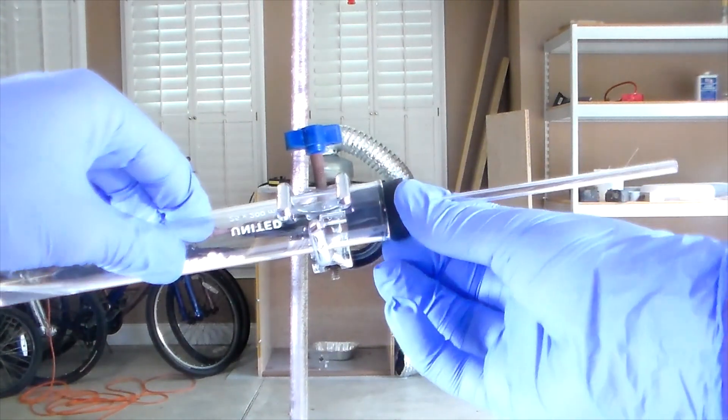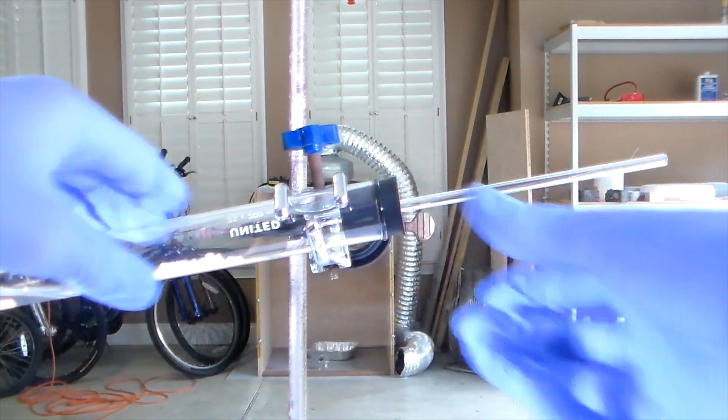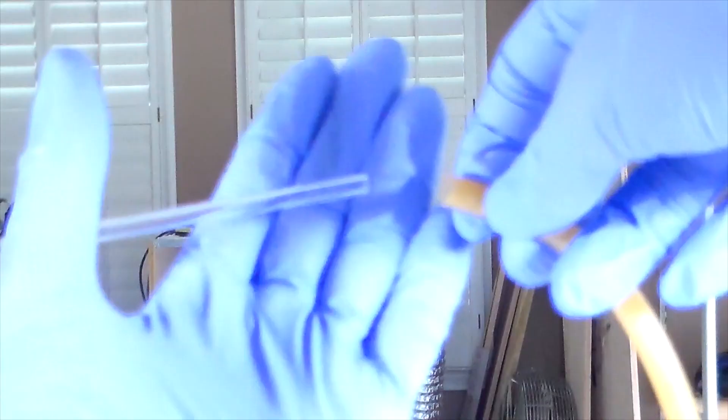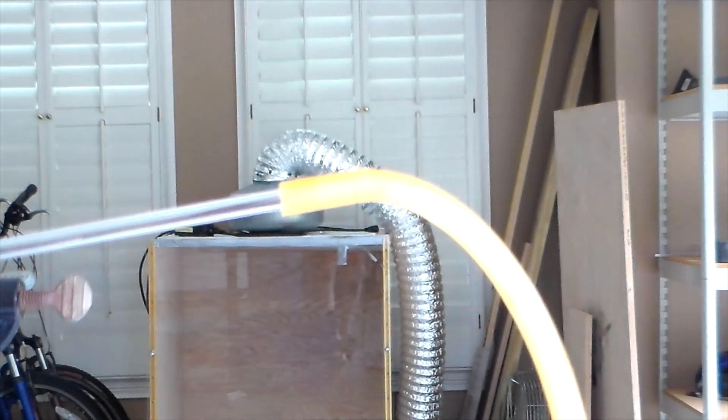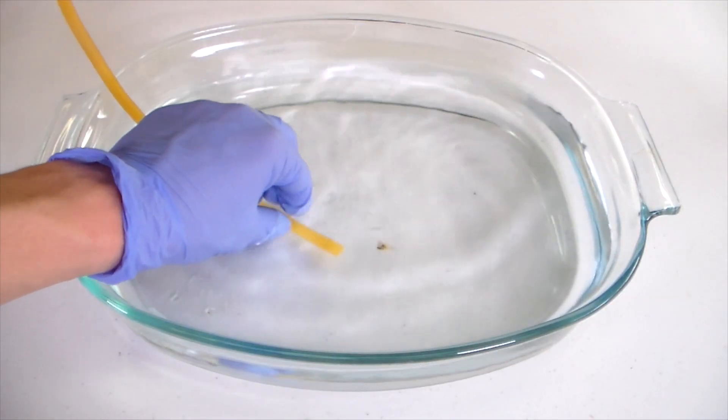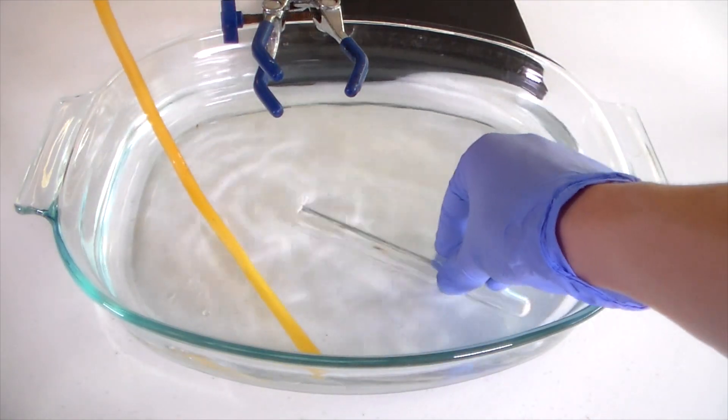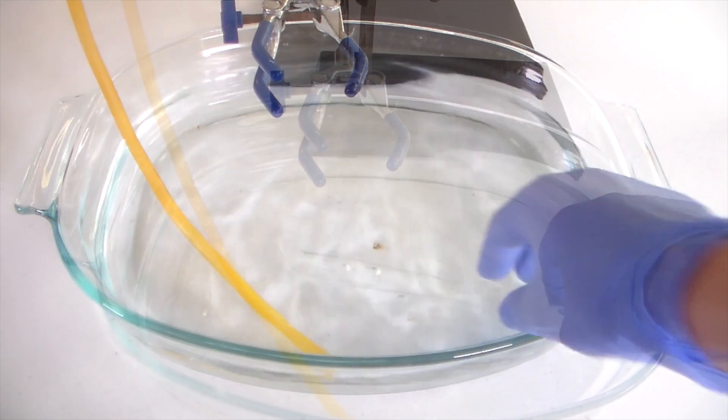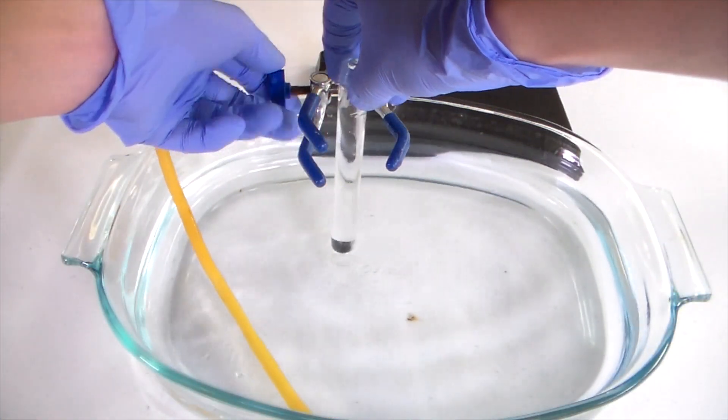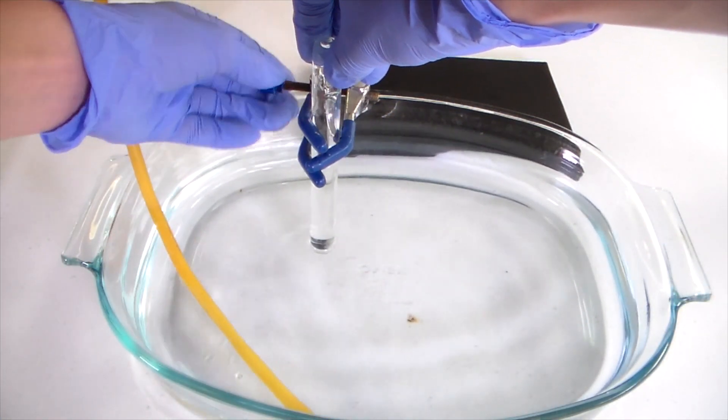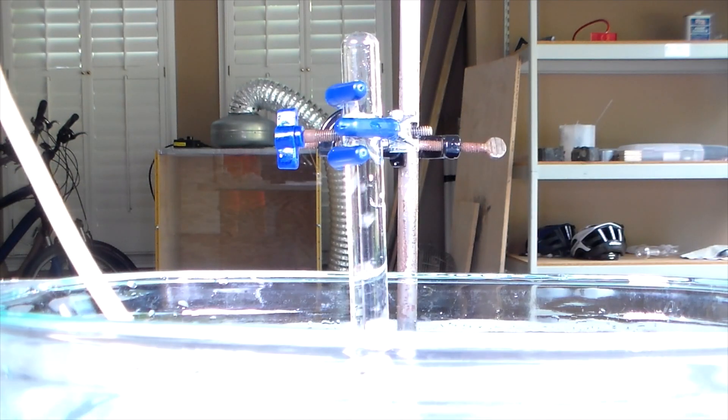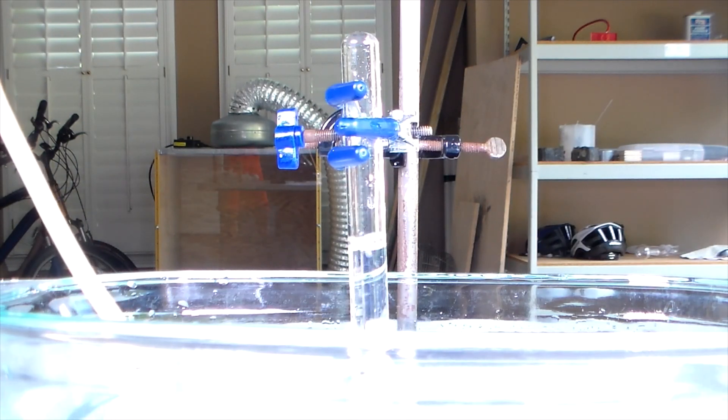Next, add a one-hole rubber stopper with a glass tube in it to the test tube. Attach a plastic tube to this glass tube. Insert the other end of the plastic tube into a tray full of water. Now you will need to fill a test tube with water and insert it into the water tray upside down, securing it in place with a clamp. Make sure to leave some space at the bottom. This will be used to collect the ethene gas by water displacement.